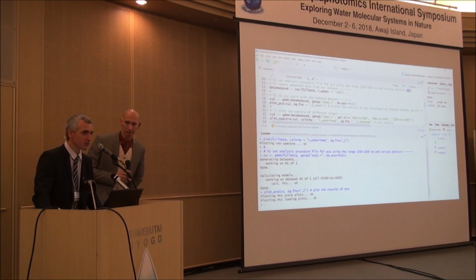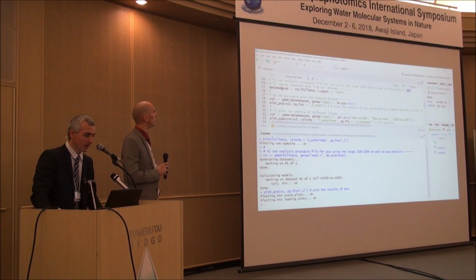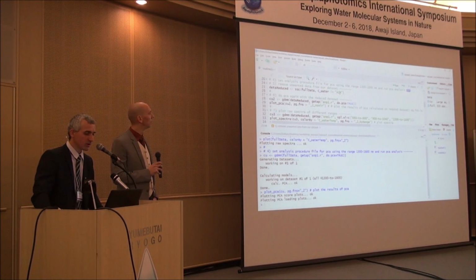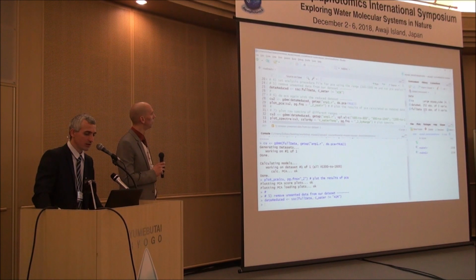Okay, so as I just mentioned, the next logical step is to kick out the air, the blank spectra, and you don't need to scroll through your entire data set in Excel. You just execute this line. SSC means subselect any class, and you provide from which class variable, which column, what type of data has to be removed. In this case, we called it air, and then if you run this, you get a reduced data set. You will see the original data contained 333 observations, while the reduced one without the air spectra contains less.